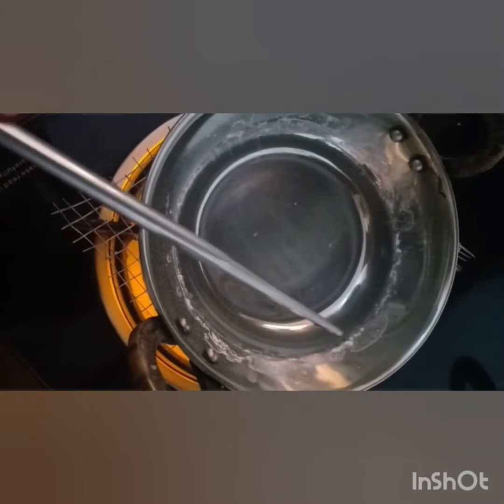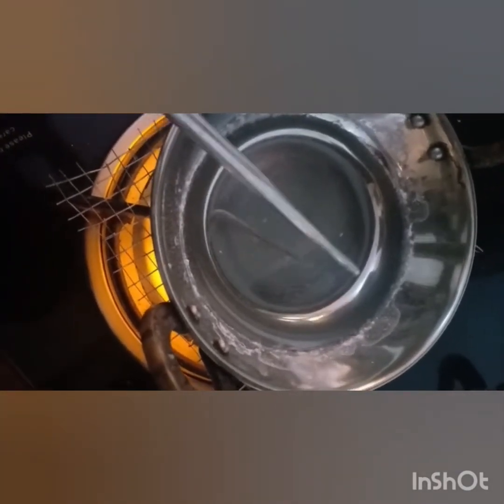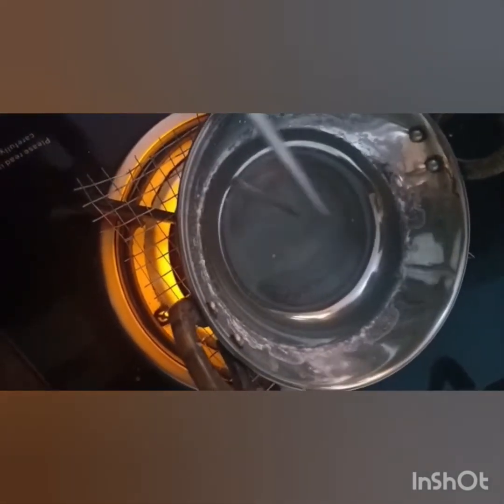See children, here the white deposits are there, which means that the water is evaporating from here and leaving behind the white deposits. So in a while the whole water will evaporate and you will see the deposits here at the base of the evaporating dish.